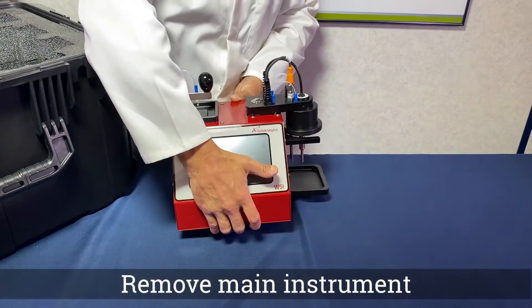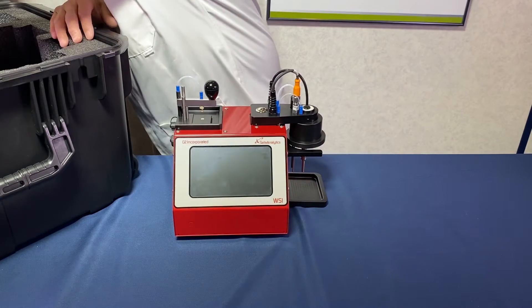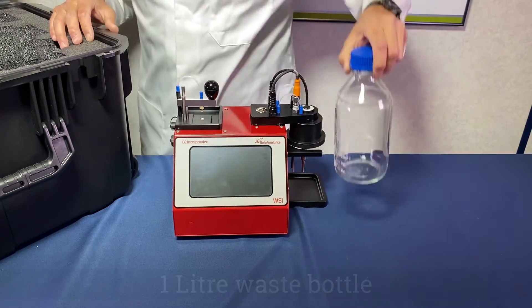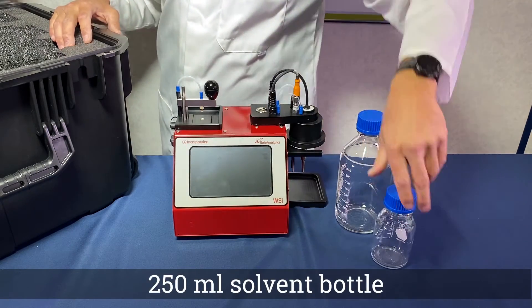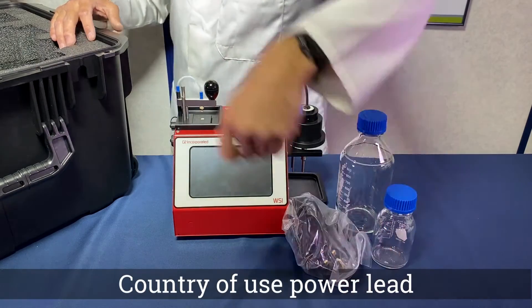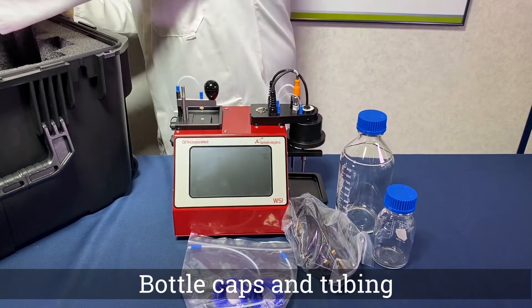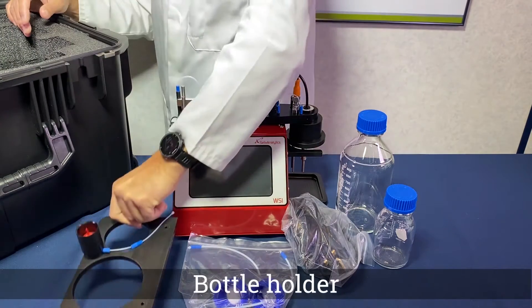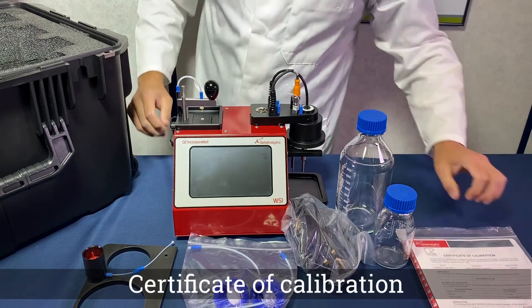Start by removing the main instrument, the 1 litre waste bottle, the 250 millilitre solvent bottle, the country-specific power lead, the bottle caps and tubing, the bottle holder, and the calibration certificate.